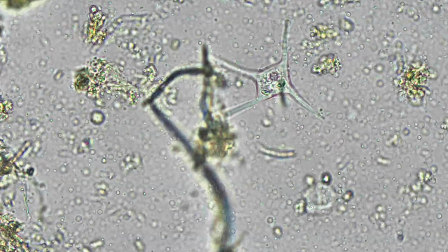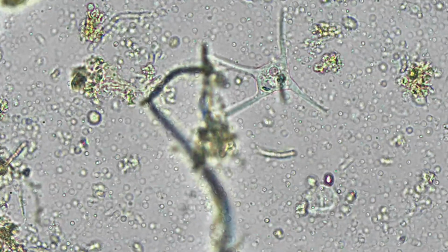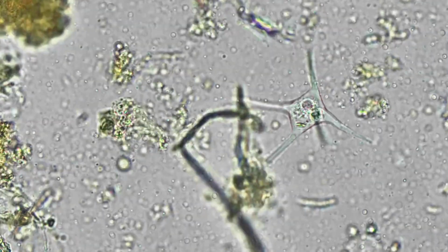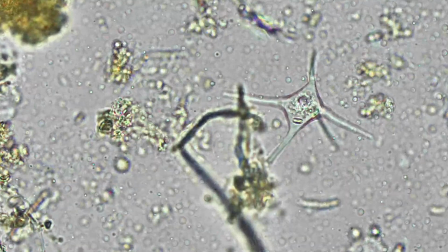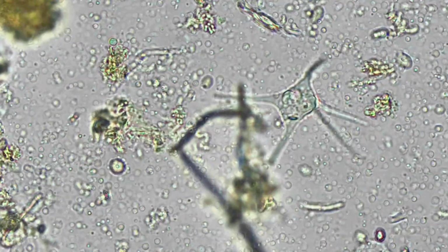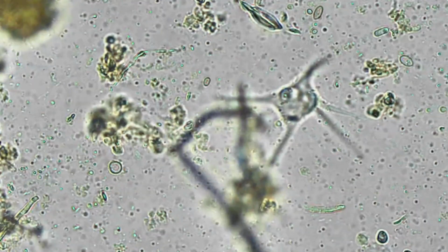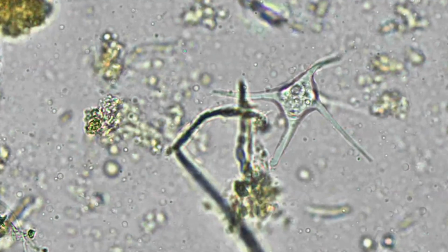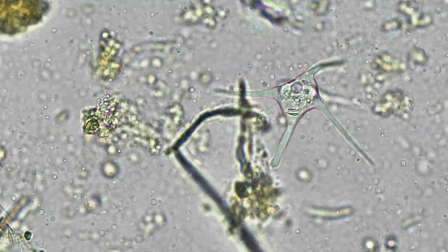There are many different amoebas that have this star pattern to it. So I'm just calling it a star amoeba. If it was a naked amoeba, it would just kind of be like a blob. I've seen naked amoeba make this pattern, but then move out of it. So it's probably just coincidence. There's no coincidence here. That's definitely some type of star amoeba, which looks really cool.